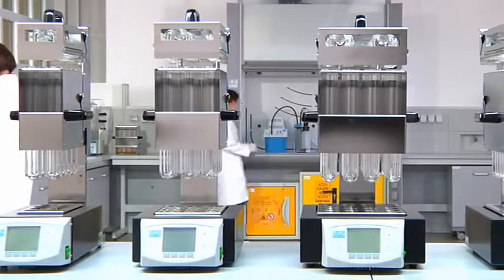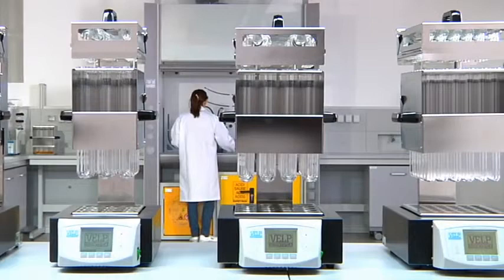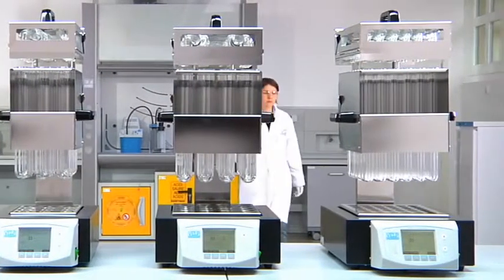Units accept 8 standard 250ml, 12 250–400ml, 20 250ml, or 42 100ml water digestion tubes.